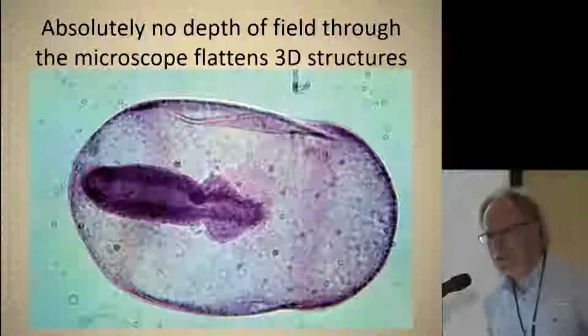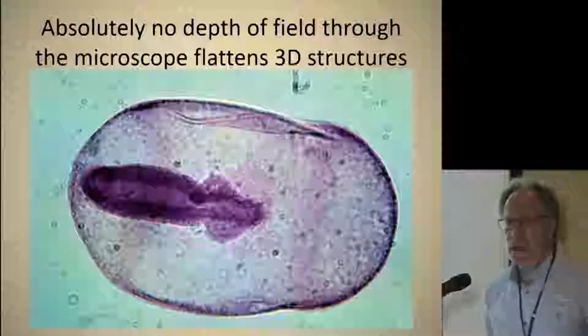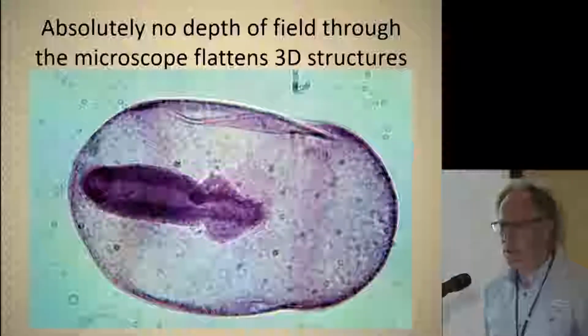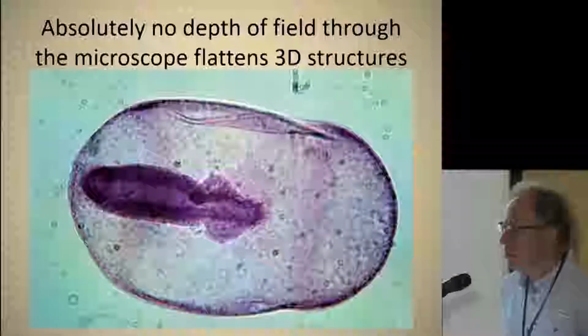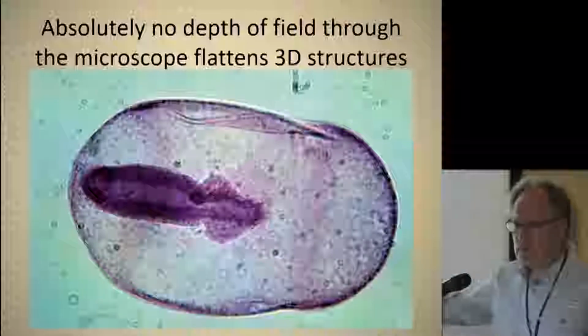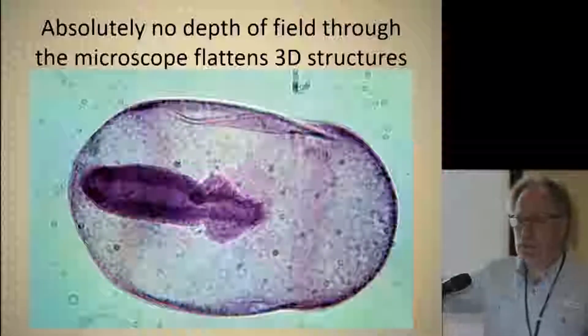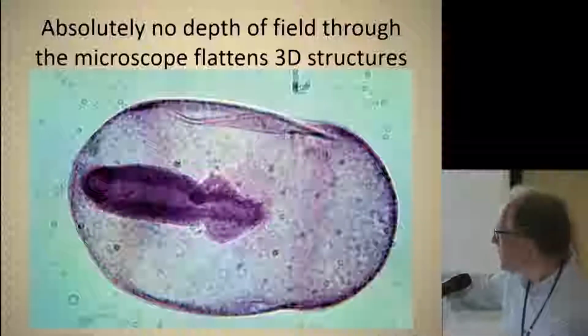Jumping back to last year's meeting, for those of you who were at the New Orleans meeting when we did an IVF and generated the sea urchin embryos, we couldn't take it more than about the 4-cell stage because time ran out in the workshop. But I do this routinely, and this is a much later stage of gastrulation. This is cheating a little bit. This is a starfish, not a sea urchin, but the embryology is the same.